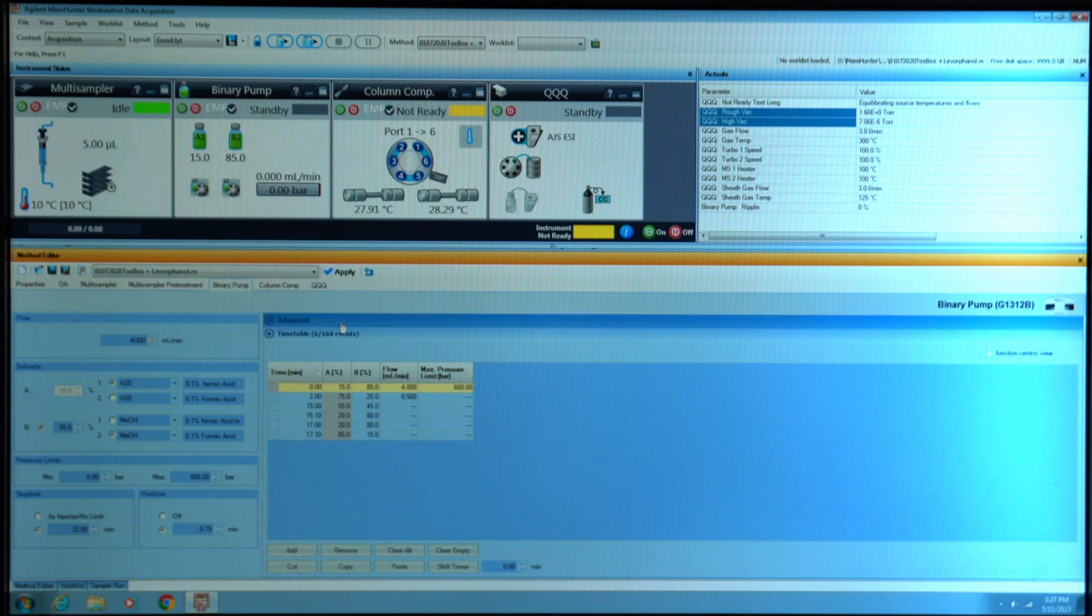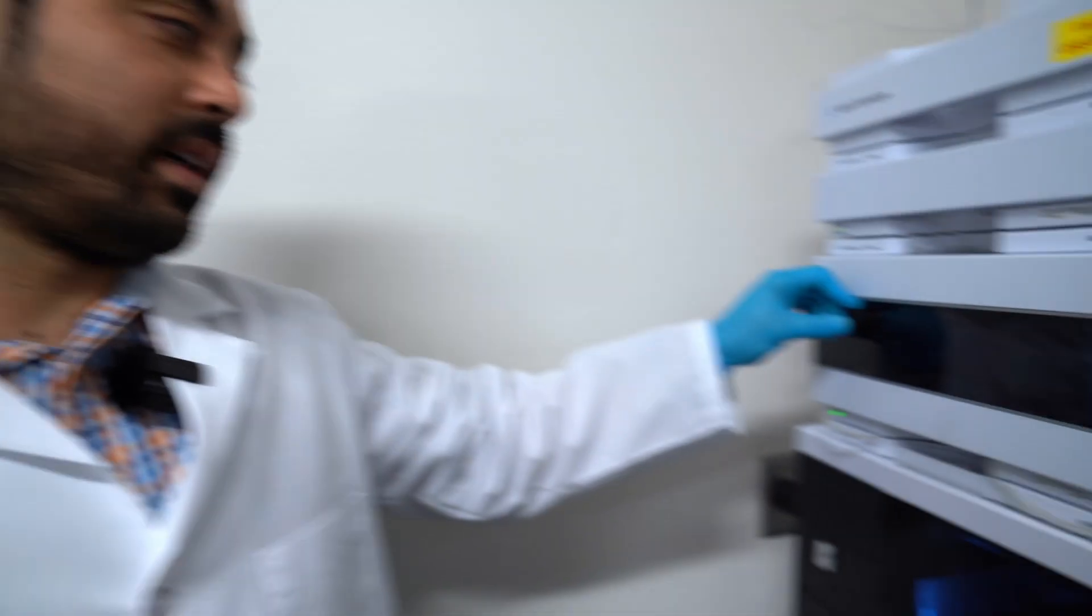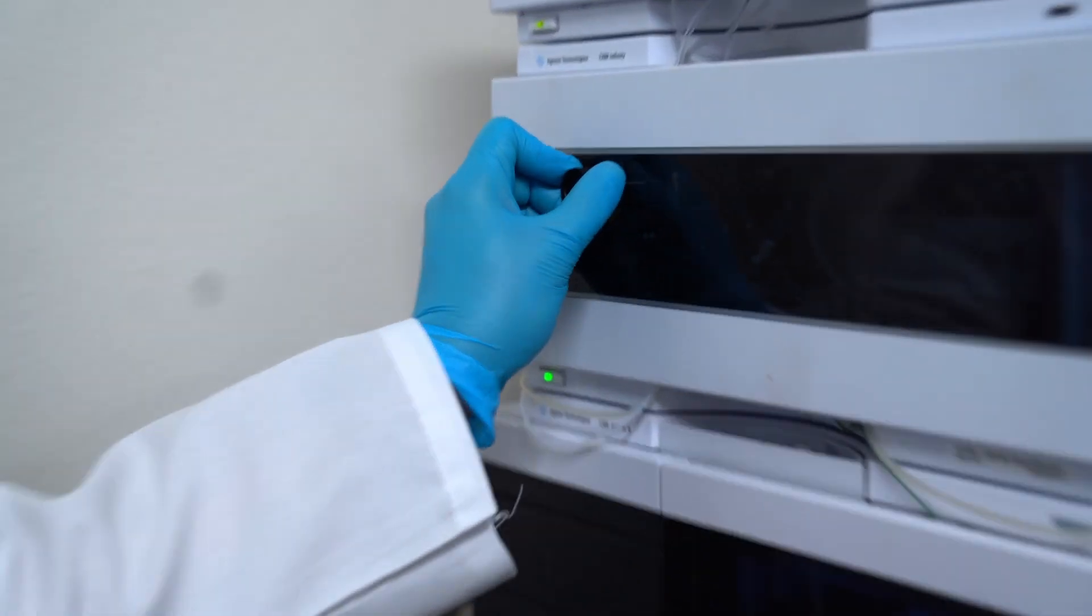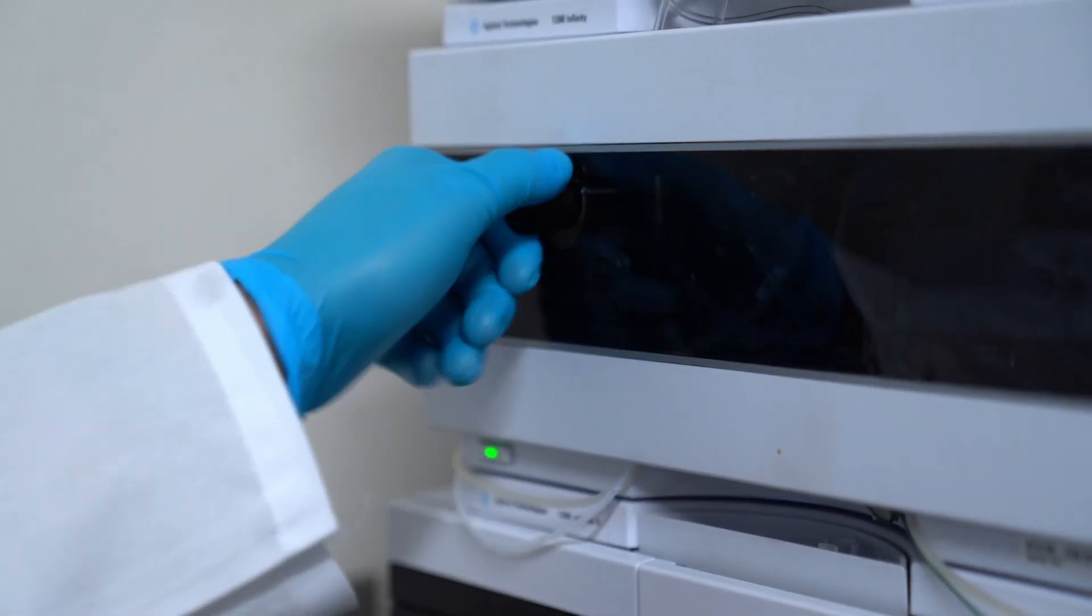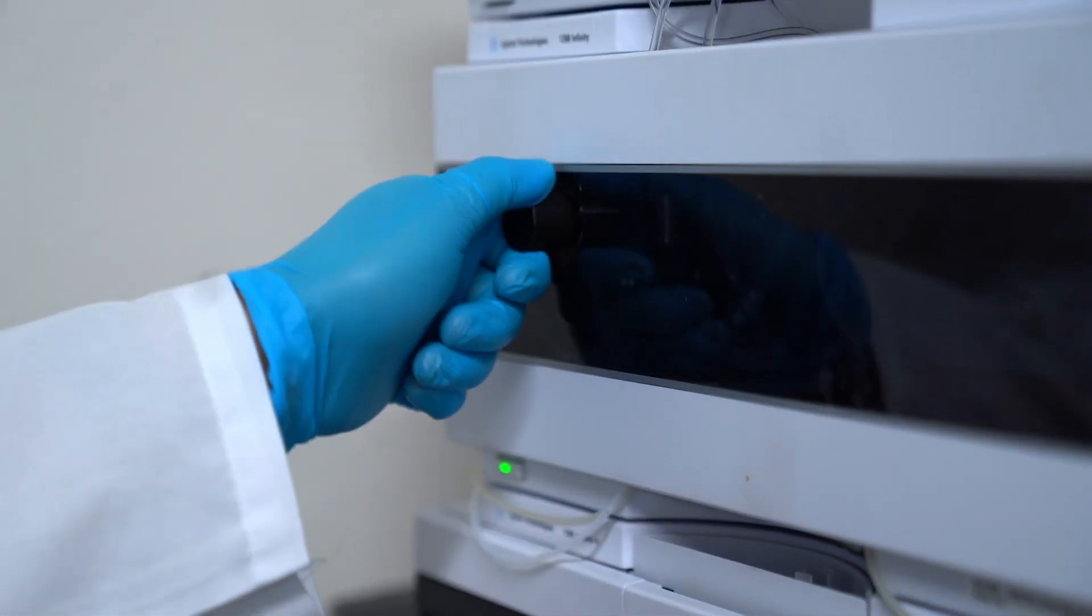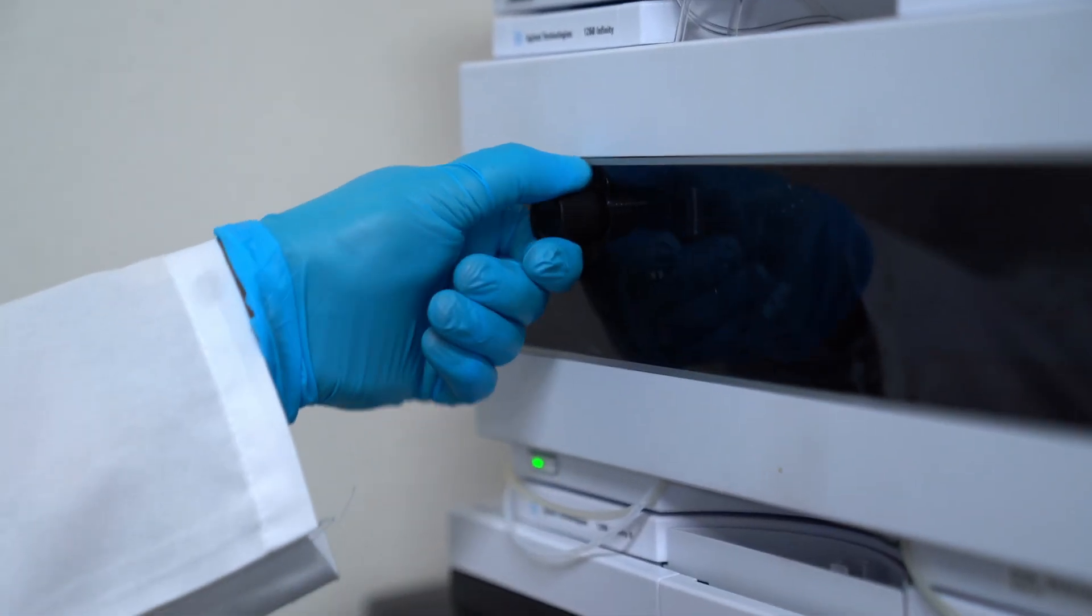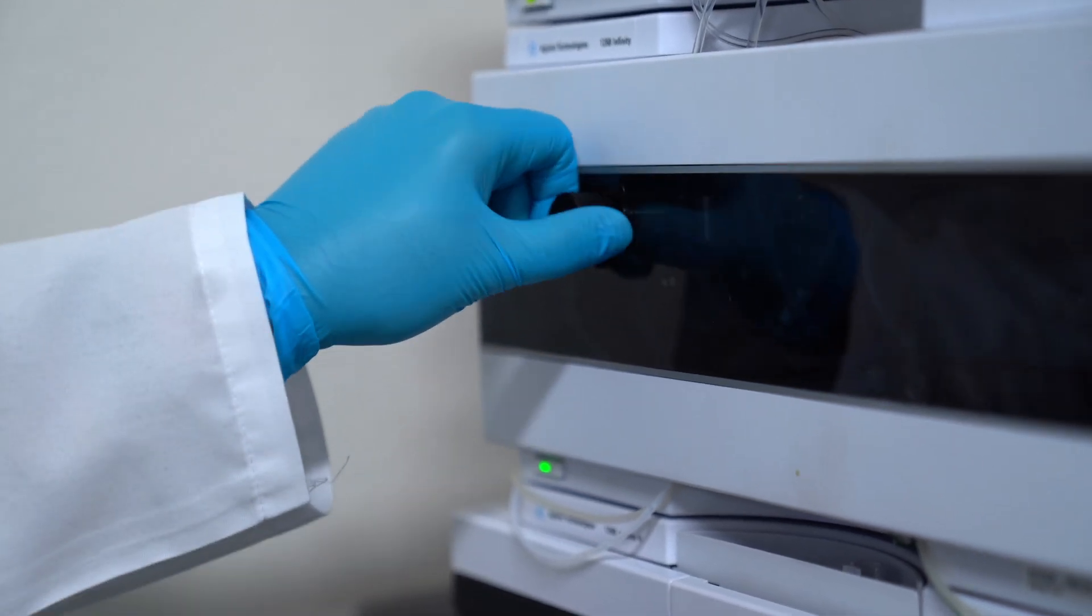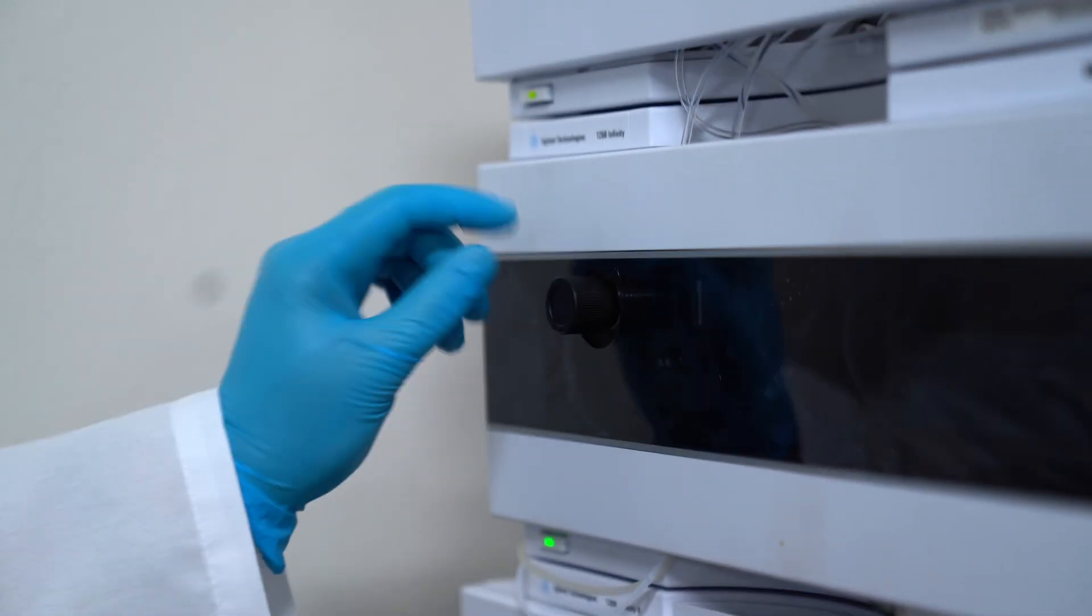Next, make sure you go over and open the drain valve. You turn it lefty loosey to open it all the way. If you want to tighten it, turn it right, but when you're purging, make sure it's all the way to the left.